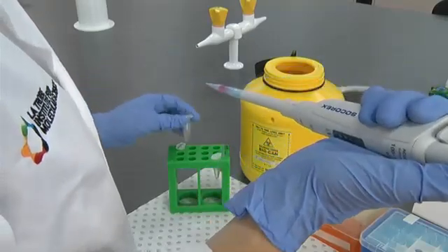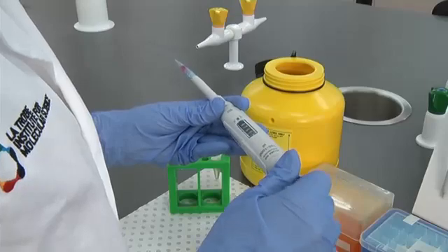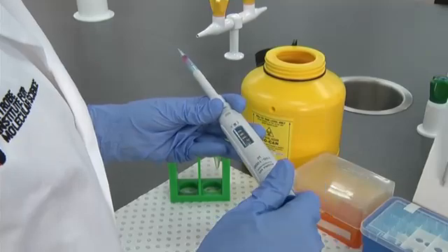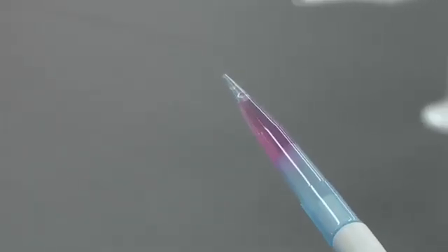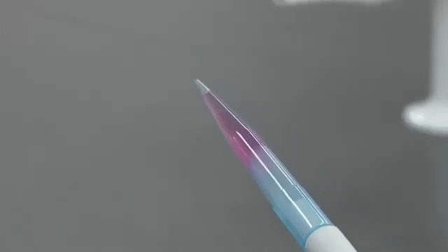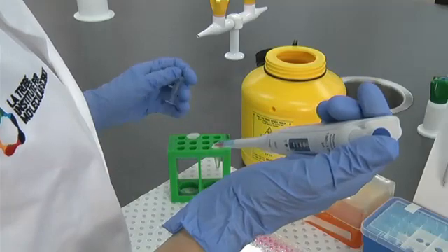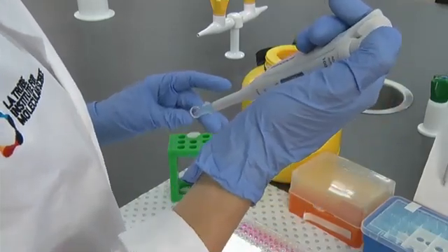Change the grip on the pipette, holding it horizontally, so you can observe the volume indicator. Decrease the volume of the pipette until the liquid is pushed down to the very end of the tip. Look at the volume indicator — you now have an estimate of the volume. You can dispense this liquid into a clean tube for the next step in your procedure.